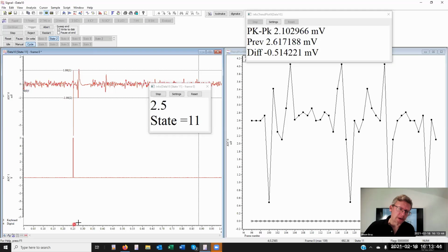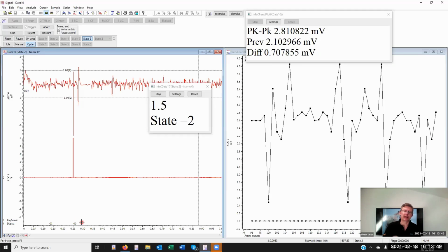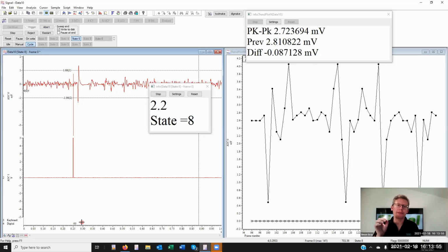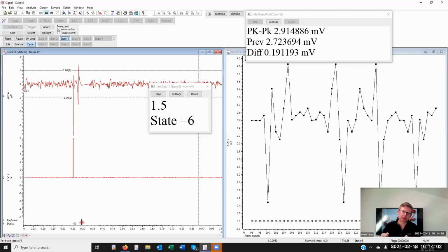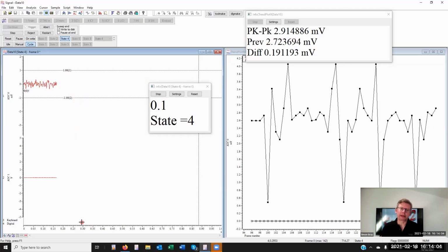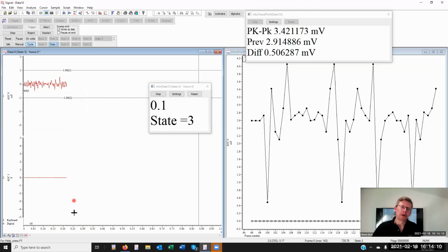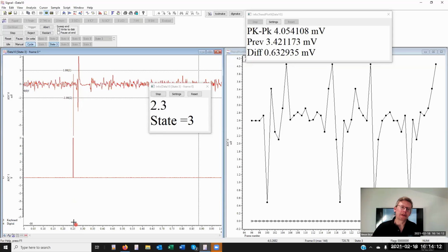The digital marker, though, is put in by the graphical sequencer or text sequencer in this case. So I've carefully placed those markers at the time that the digital pulse will go out. Rather than wiring out of the digital output port back into an ADC and wasting 5,000 samples a second on this channel, I get a single event like that with a code, and that's much more accurate.